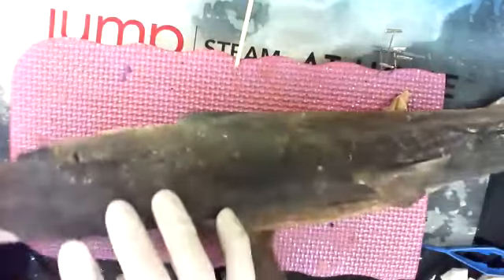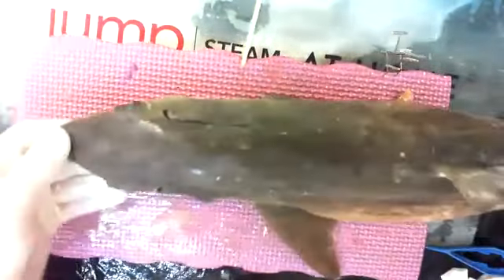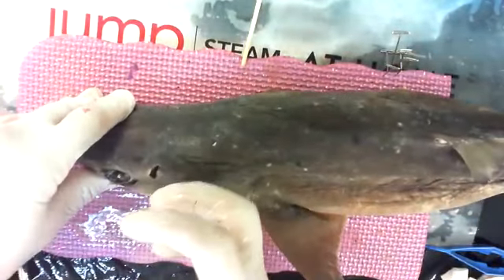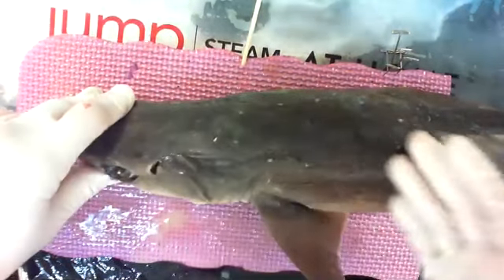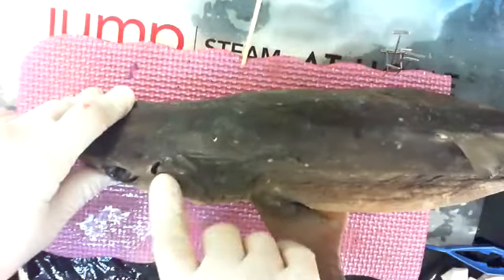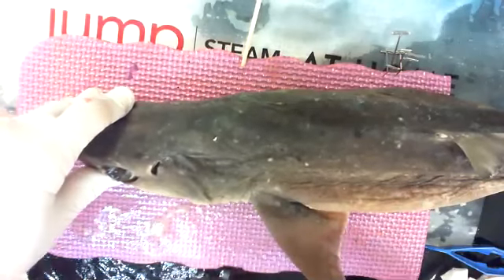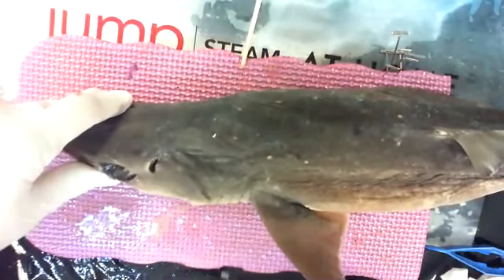We'll look at the eyeball. Both of them are pretty dry. So one of the things that happens, your eye is filled with fluid. It's called vitreous humor that gives it shape, makes it round like a marble. But when you die, fluids start leaking out of your body. So that water leaks out. It's not held in there anymore. And that's why there's so much fluid in the sac with it. And that's why this seems collapsed like a raisin instead of looking like a grape like it should.